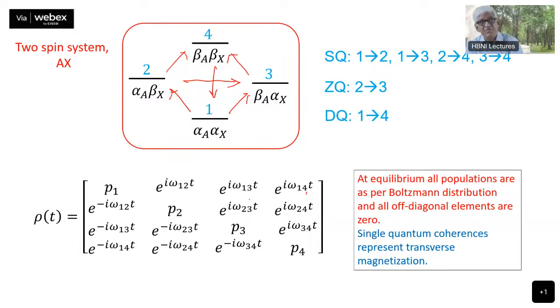This we have also seen when we described the equilibrium magnetization using classical precession. If you remember that, let me draw it once more for you. This is my B0 field. Then I have this cone here. Spins are precessing around this, and they are distributed all over the cone. This is the same for the lower half also. This is the precession we described earlier, right?